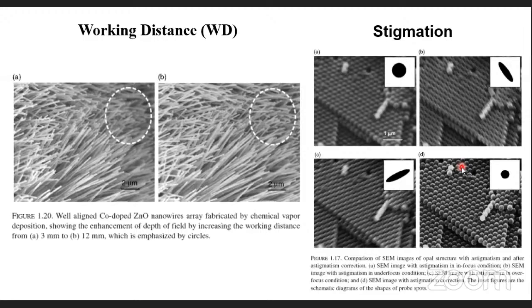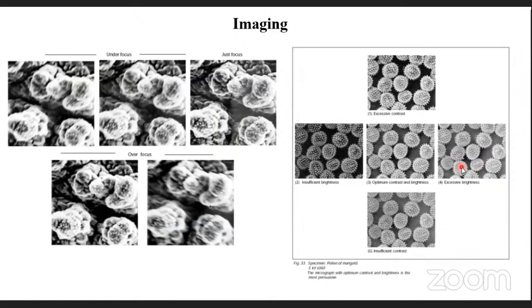Stigmation (astigmatism) is a problem with the lens that can be corrected by the technical staff by adjusting the current. When analyzing, you should know the mode, acceleration voltage, and working distance, then adjust the lenses. The important point is imaging — with an experienced technical staff, it is easy to take very nice images. You can see under-focused, just-focused, and over-focused images. We must capture just-focused images, adjusting brightness and contrast optimally for good publication.